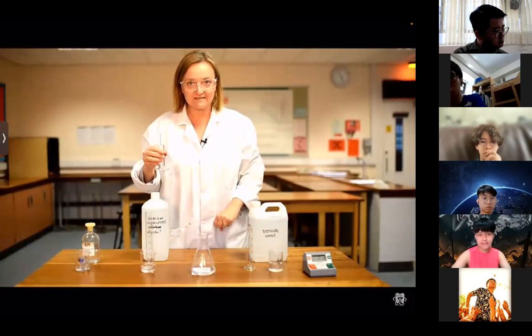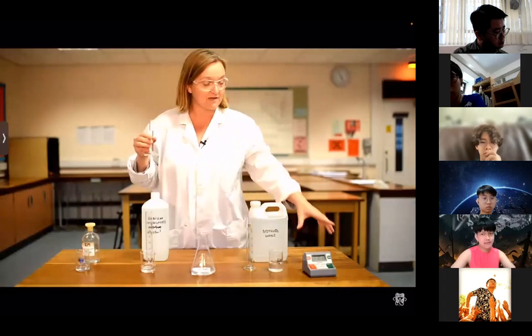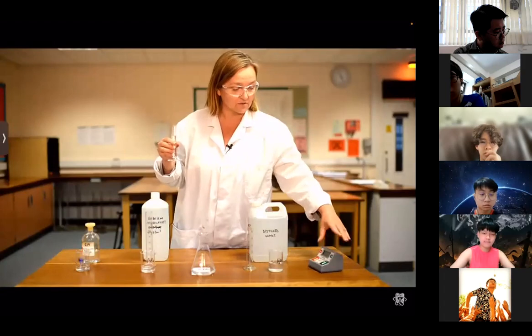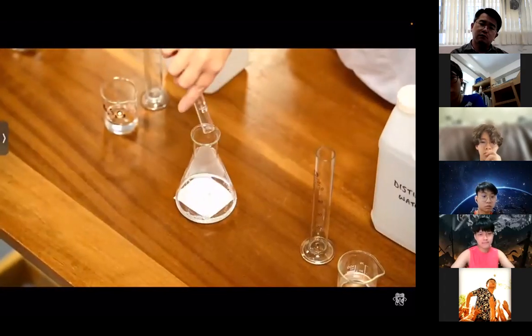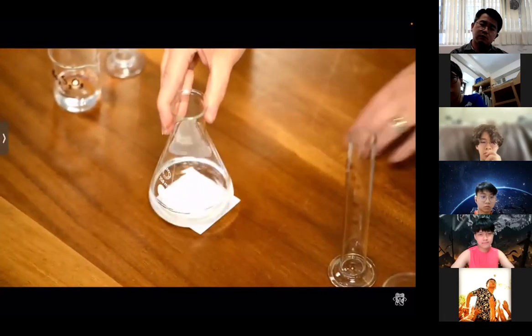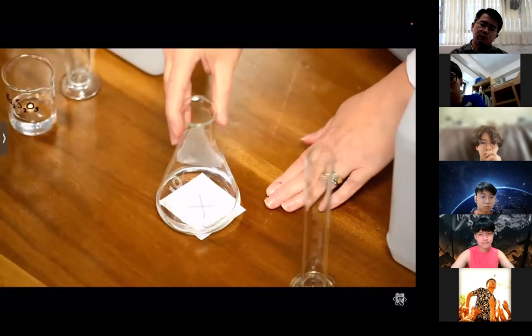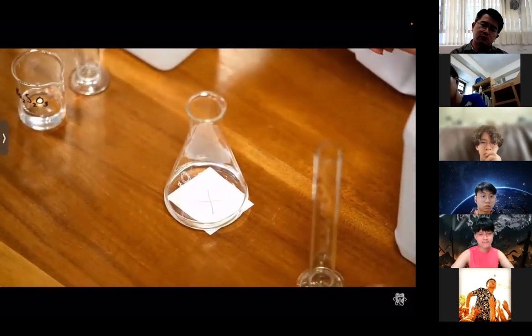The reaction is going to start as soon as I mix the acid with my sodium thiosulfate, so I need to be ready with my timer to start as soon as I add it. Just a swirl or two to get them well mixed, and then I'm going to observe the cross through the solution by looking directly above.